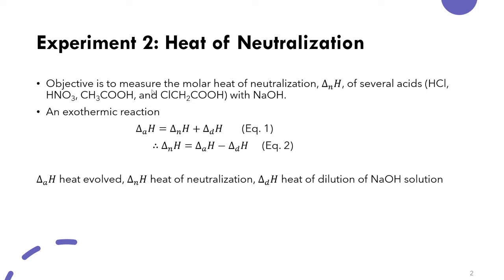So today the objective is to measure the molar heat of neutralization of hydrochloric acid, nitric acid, acetic acid, and monochloroacetic acid. The base that we are going to use is a strong base, which is sodium hydroxide.